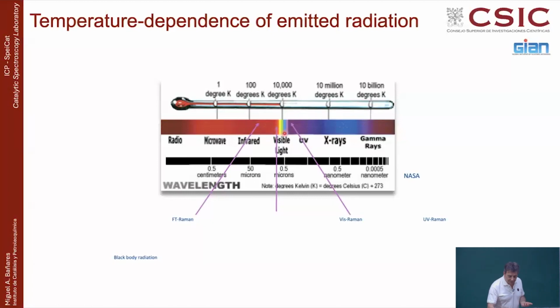Now, if things get very hot, have you seen in the television news when they are talking, for instance, of a steel factory with all the molten steel? What is the color of it? Bright red. You see like light coming out of it. You see this light. So imagine that you are a spectrometer and you are looking there trying to see some green, yellow photons, and then everything is bright. You cannot see.